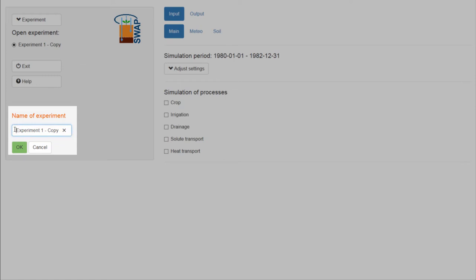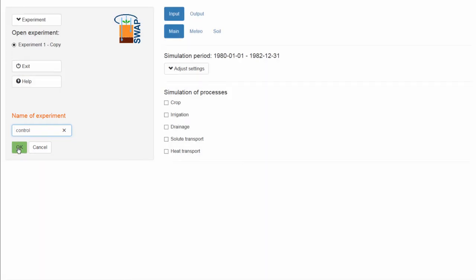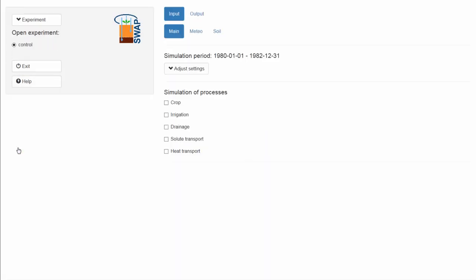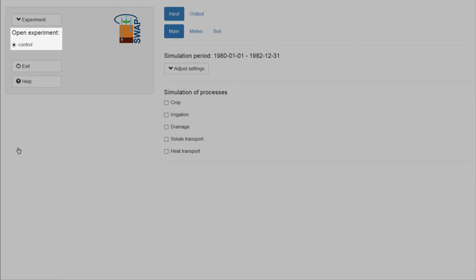I want to save the experiment using the name Control, which now becomes visible in the list of open experiments.